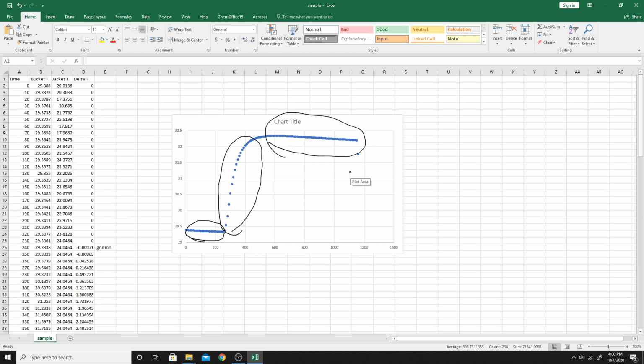Note that in this data file the last data point is obviously an outlier, so we need to remove it. It's important that before the temperature rise, we have a straight line, meaning the temperature is stabilized. We also need to find a range in stage 3 where the temperature starts to stabilize. To do that, we need to find the temperature range. So first let me erase this.